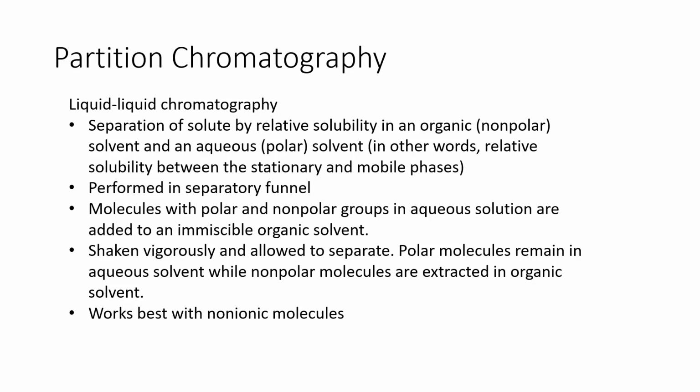It's performed in a separatory funnel. Molecules with polar and nonpolar groups in aqueous solution are added to an immiscible organic solvent. It's then shaken vigorously and then allowed to separate. Polar molecules remain in the aqueous solvent, while nonpolar molecules are extracted in the organic solvent. This works best with non-ionic molecules.